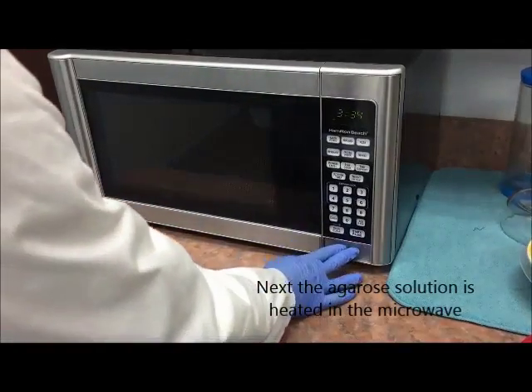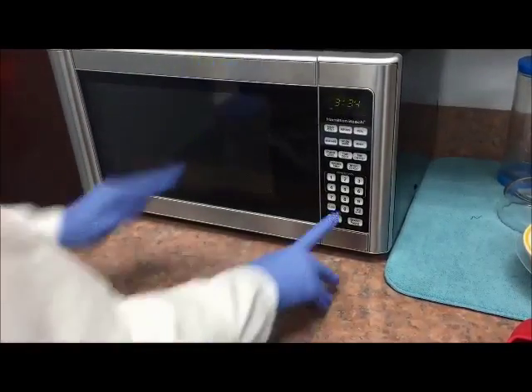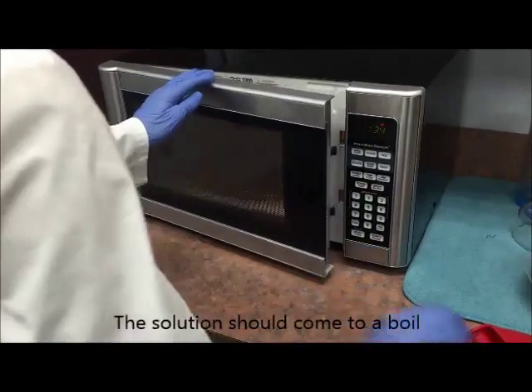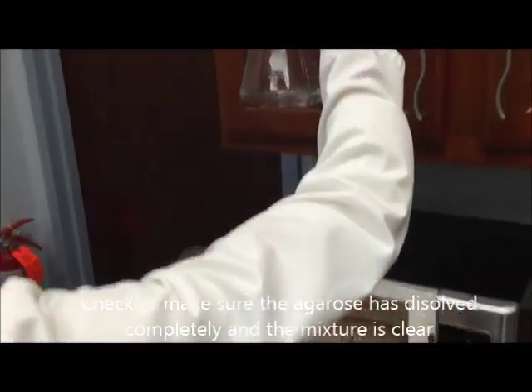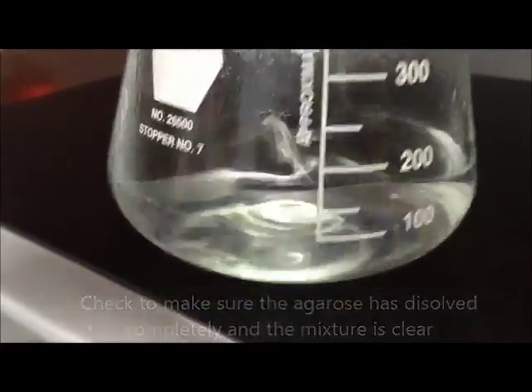Next, the agarose solution is going to be heated in the microwave. 1.5 to 2 minutes at maximum power is usually sufficient. Make sure the solution comes to a full boil, and carefully remove the flask using your hot mitt. Check to make sure the agarose is dissolved completely and the liquid is perfectly clear.